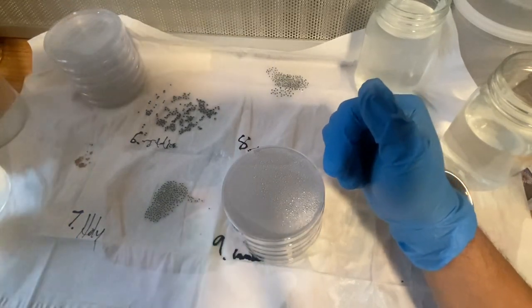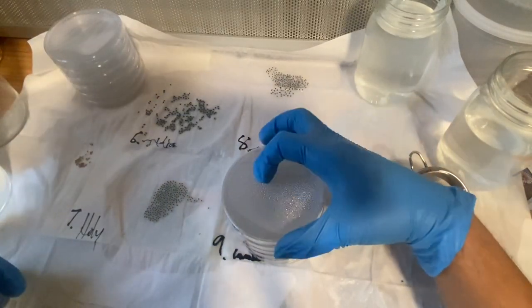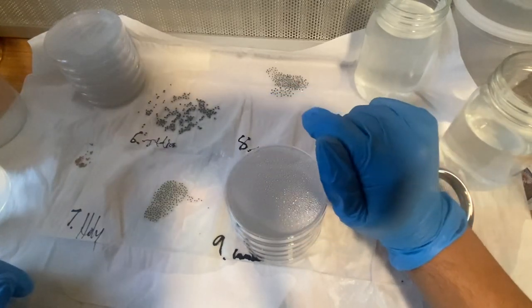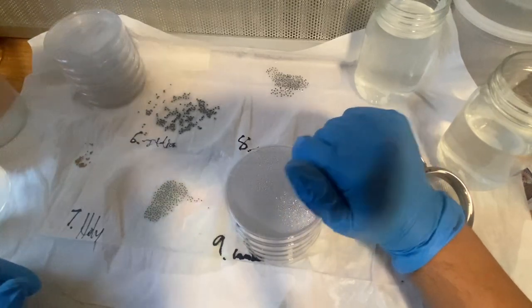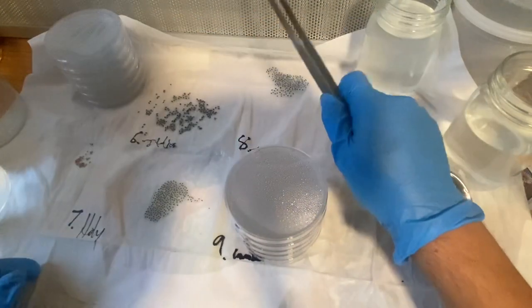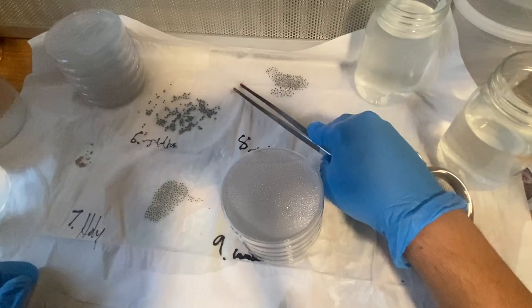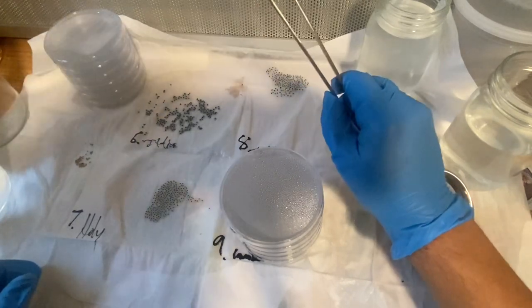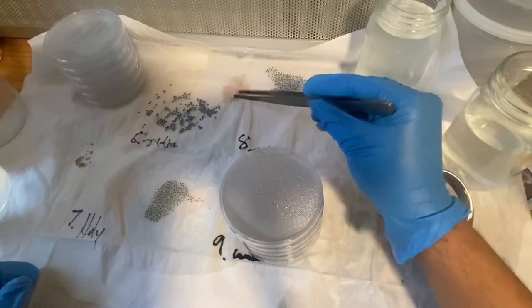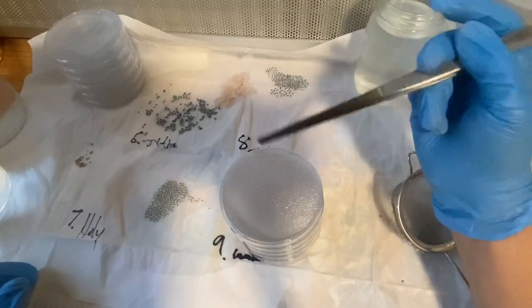Or read. So let me get my tools. I'm putting them inside my tool sterilizer. I'm going to use about 3 plates per thing. So we've got 4 here, so we're going to use about 12 plates. I've got some more over there. I'll probably have to subculture after 2 to 3 weeks because they're going to outgrow them super fast. And then they'll move to containers. So for seeds, ventilation isn't that important, so it really doesn't matter what vessel you're using. You kind of want a higher humidity setting.